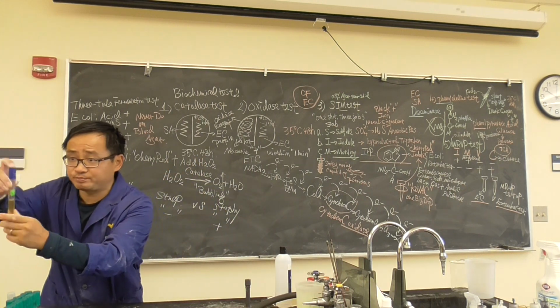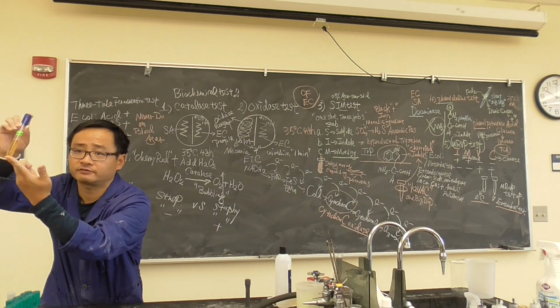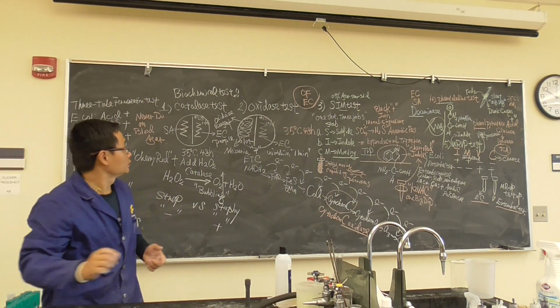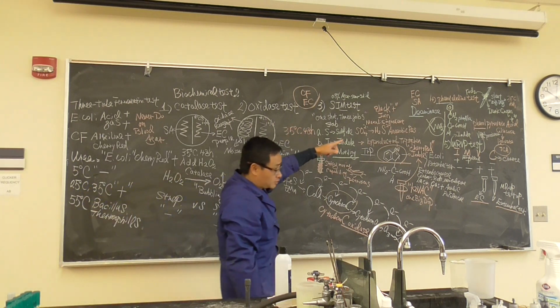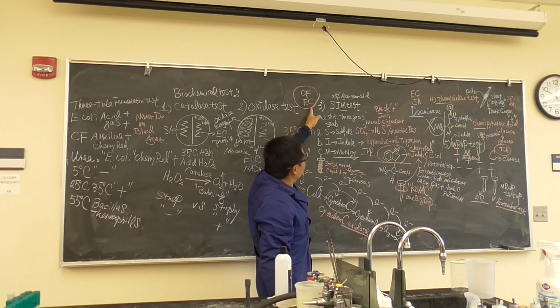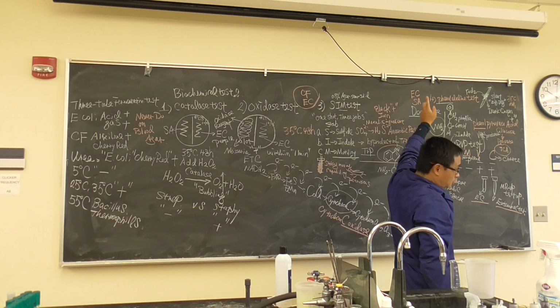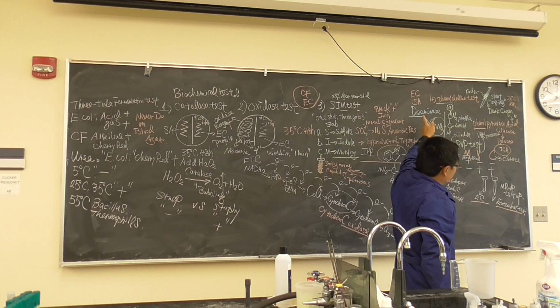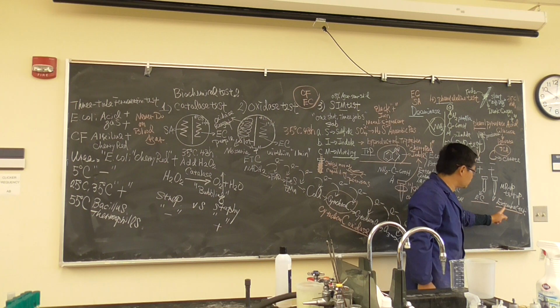For Neisseria, in the broth you need to shake very well, as a lot settles at the bottom, okay? Right side E. coli. SIM test, you do Citrobacter, your bench partner does E. coli. Phenylalanine test, you do E. coli, your bench partner does Staphylococcus aureus. Last, MRVP test, you do E. coli, your bench partner does Enterobacter.